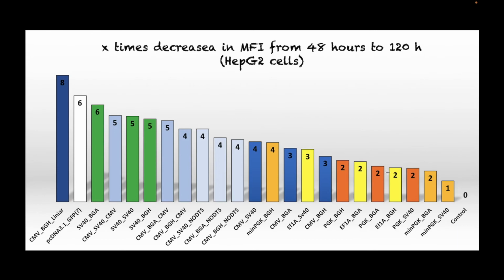I know things are a bit complicated, but I needed to choose a promoter and terminator combination that I'm going to use in the future. Because, as I said, my plasmid will not remain in its current form.